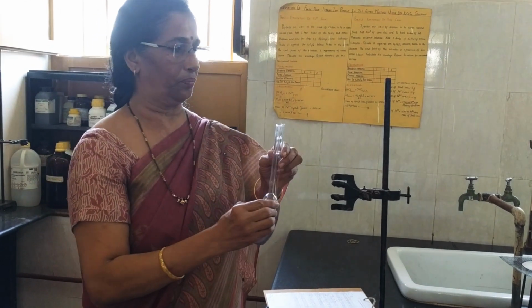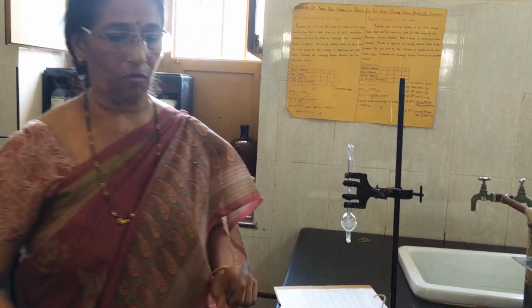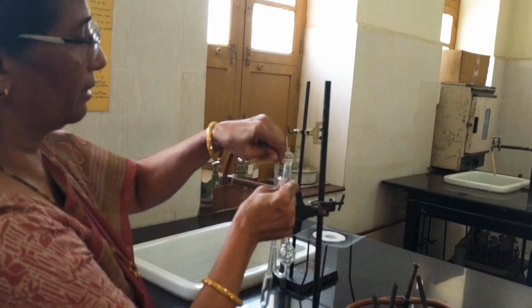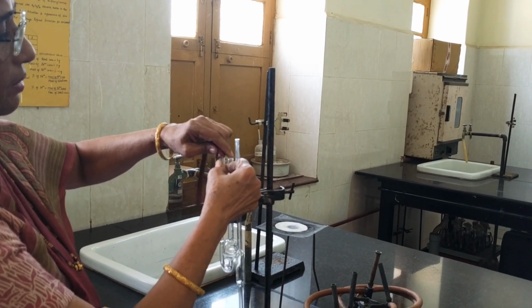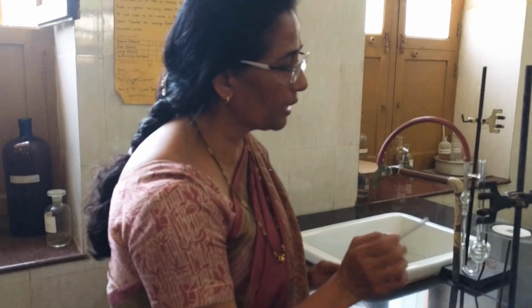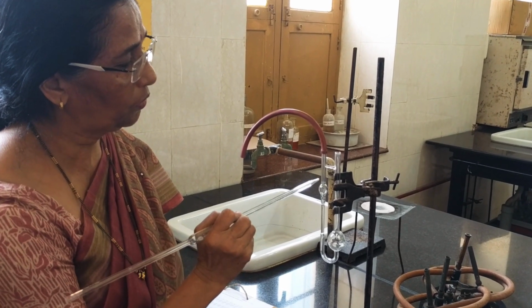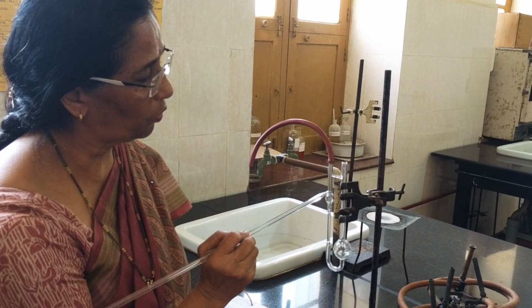Now, how am I going to do it? I am going to clamp this viscometer onto this here. Take 10 ml of the liquid for which I need to determine viscosity. Pour it through this knob. Use this other end and fit it with a rubber tubing. Then suck the liquid to a height on this side, and I can see that there is a fine marking here and another marking here. Therefore, I am going to find out, using the stop clock, the time it takes for flowing from here to here.